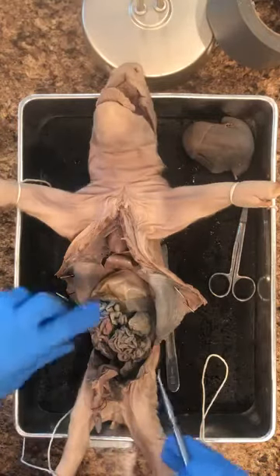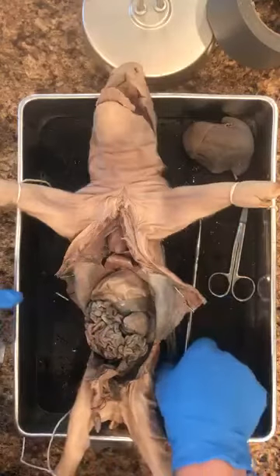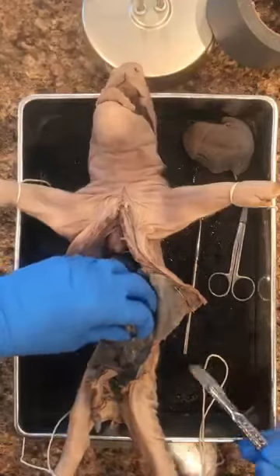Okay, so I am now going to remove this large and small intestine, and then we can look at some other smaller things inside of here.